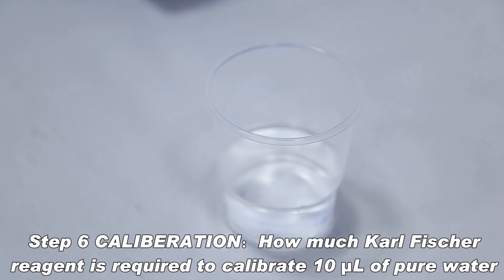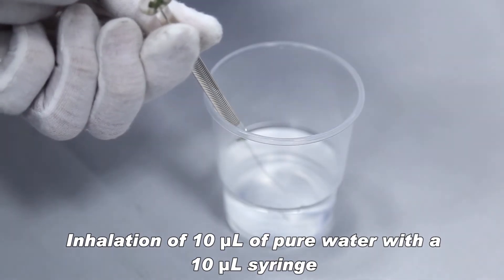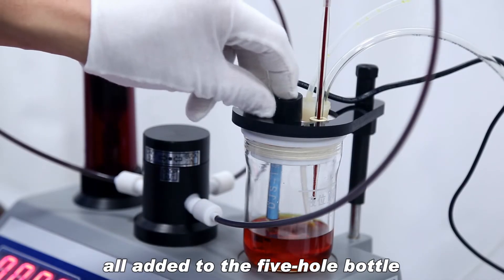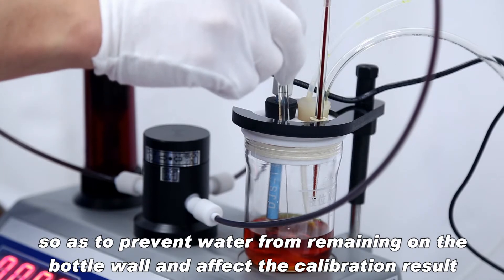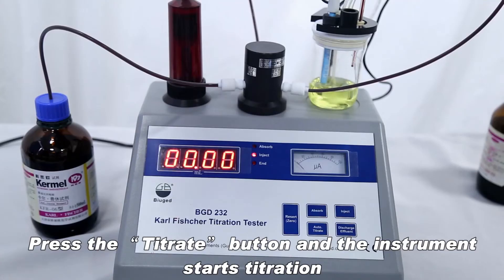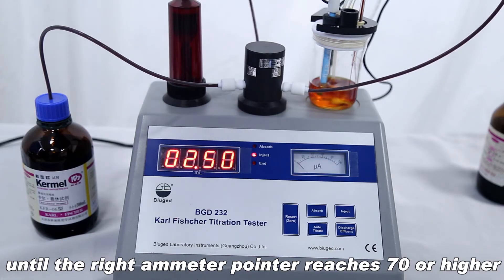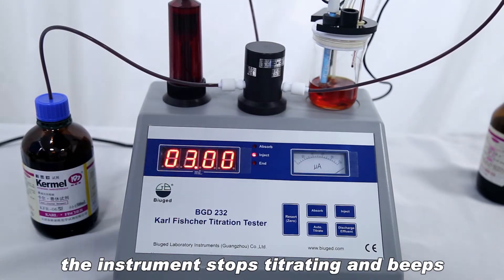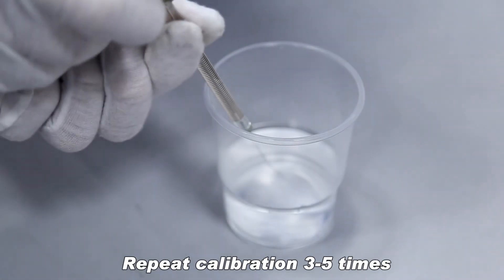Calibration: How much Karl Fischer reagent is required to calibrate 10µL of pure water? Inhalation of 10µL of pure water with a 10µL syringe, all added to the 5-hole bottle. Note not to drip onto the bottle wall when dropping to prevent water from remaining on the bottle wall and affecting the calibration result. Press the titrate button and the instrument starts titration. The display shows the amount of Karl Fischer reagent currently consumed. Until the right ammeter pointer reaches 70 or higher, the instrument stops titrating and beeps. After recording the screen display data, press reset. Repeat calibration 3-5 times.